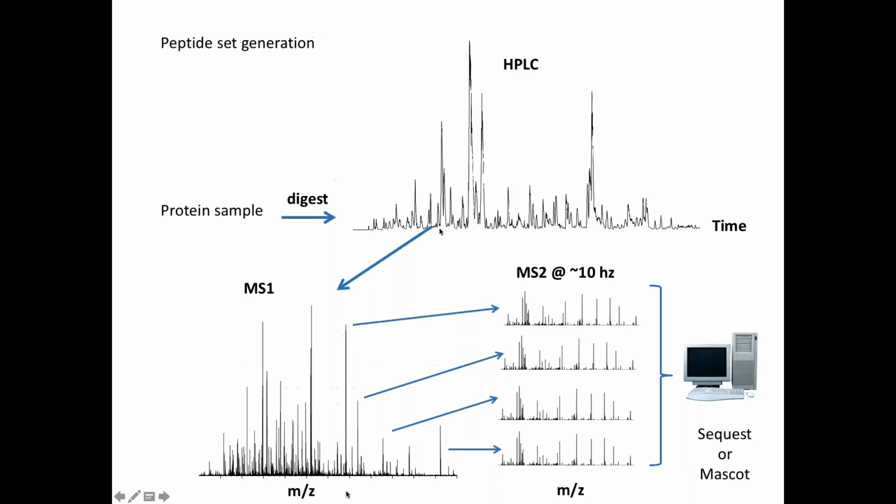Now, in a proteomics lab, if you ran a HEK cell lysate, you're putting it up against the non-redundant human protein database. For our experiments, these searches are really quick because we're only putting in the proteins that are in theory in the sample. Now we also do a decoy database, which is a database of reverse sequences of a bunch of proteins to get the false discovery rate. But these searches are super fast compared to anything you're going to get from the proteomics lab because the number of proteins is small.